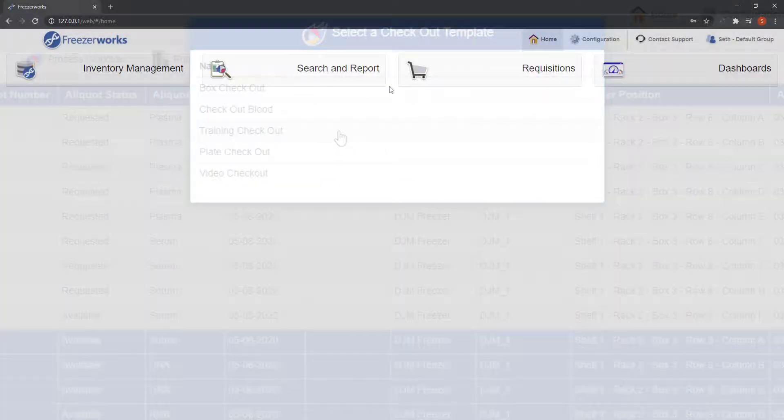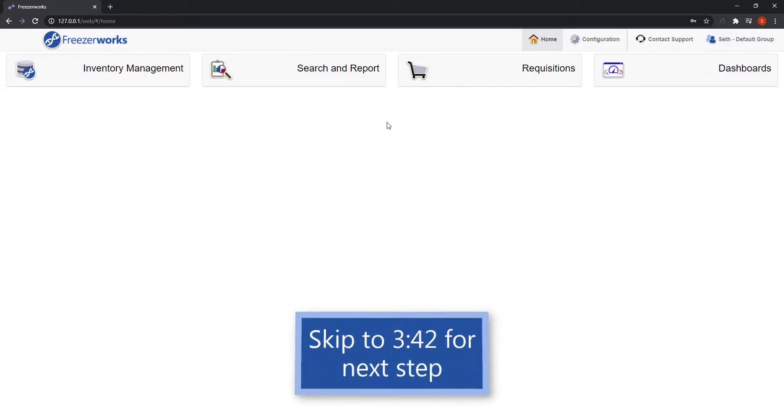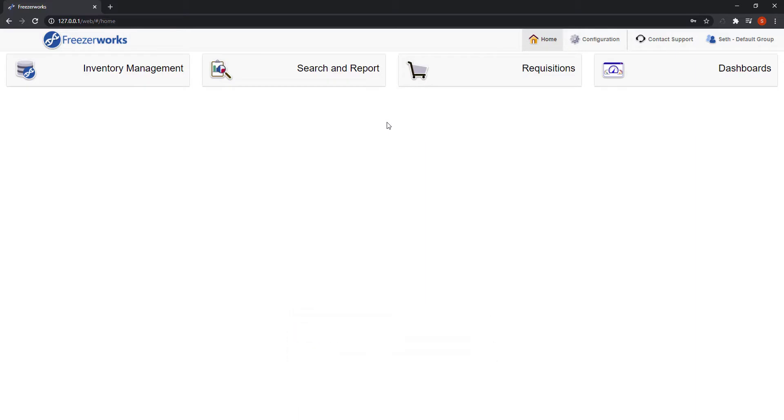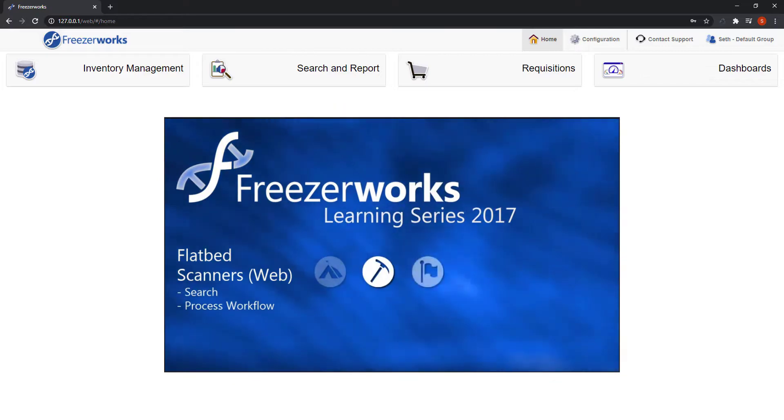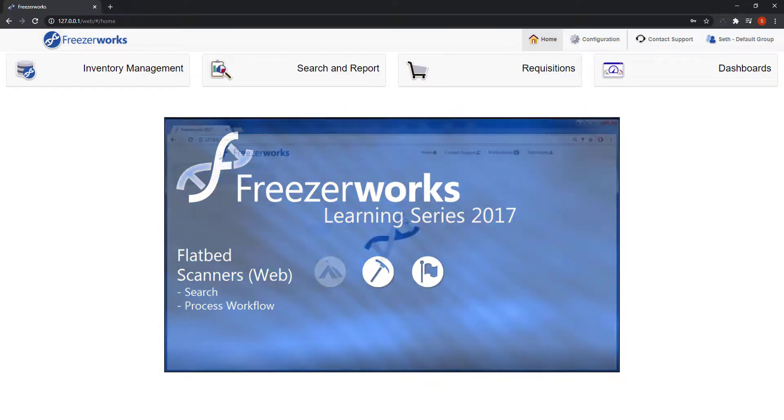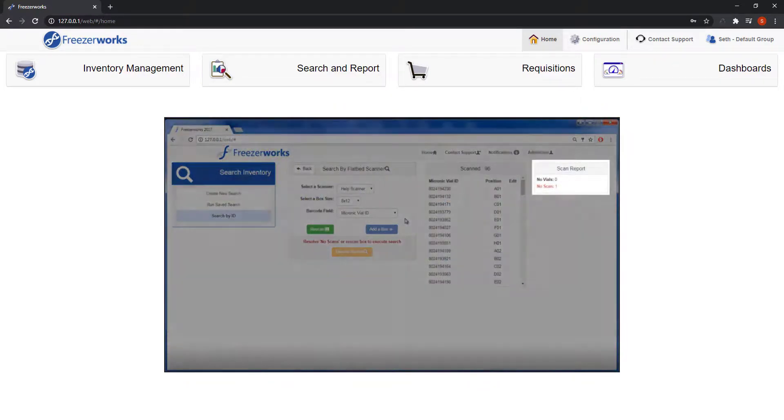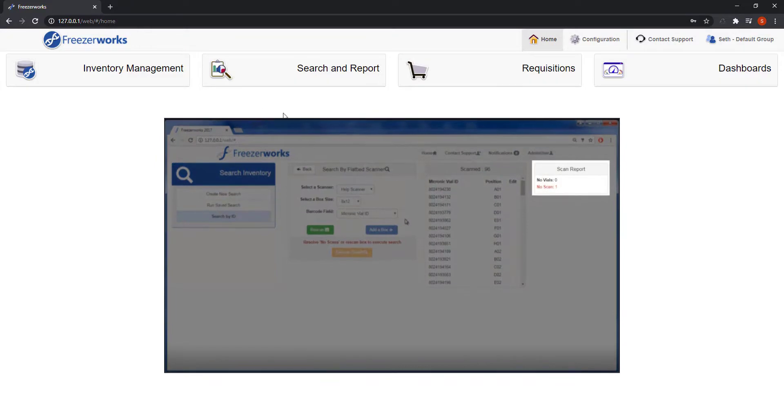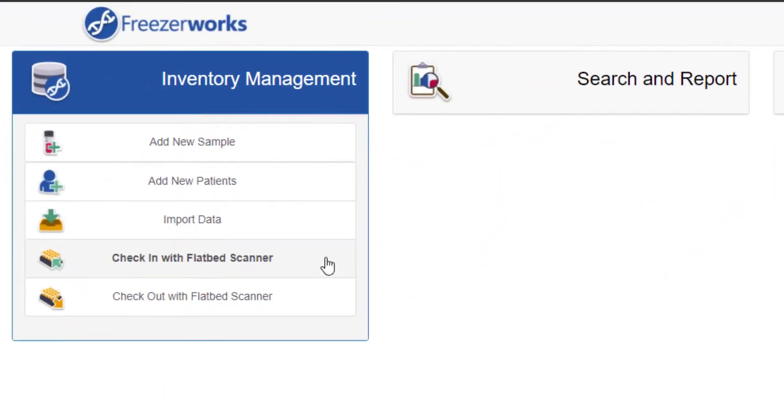The last way you can start a workflow on the web client is with a flatbed scanner. If you do not use flatbed scanners with FreezaWorks, or simply don't have them set up, the options won't even appear on the web client and you can go ahead and skip to the process workflow form. If you do use flatbed scanners and wish to know how to use them for workflows, see our flatbed scanners web client video. Again, it's an older video, but much of the material hasn't changed. Just note that you can only checkout and check in with a flatbed scanner, and that these two options are now in the inventory management tile on the home screen.